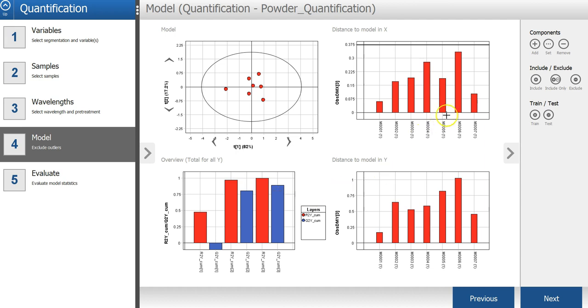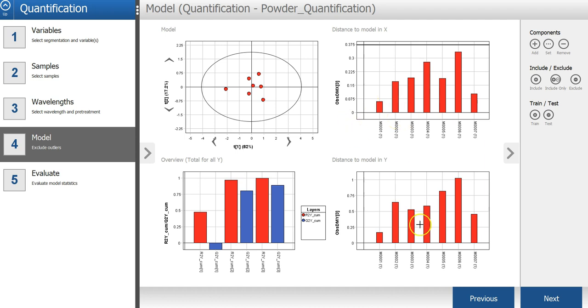The distance to the model in X and Y graphs show the distance to the model for each sample. A high bar indicates that the sample might be an outlier. The model scatter plot and the distance to model plots can be used to identify and exclude outliers, but in this case, everything looks okay.